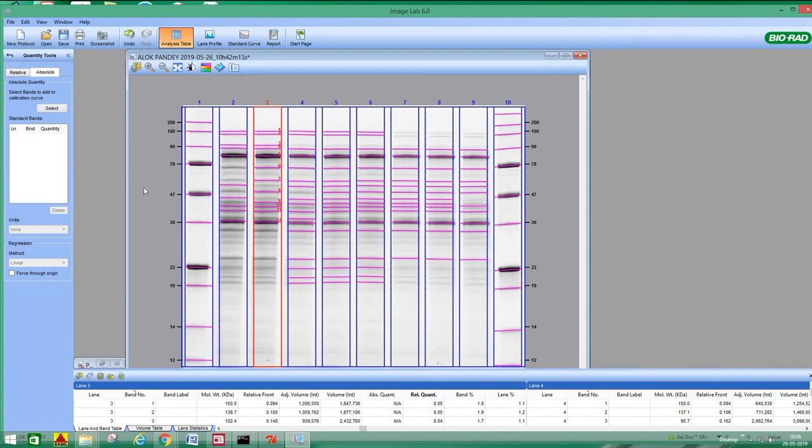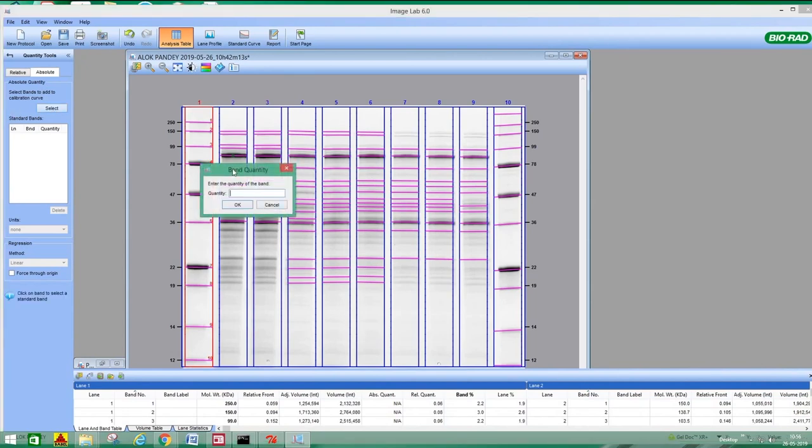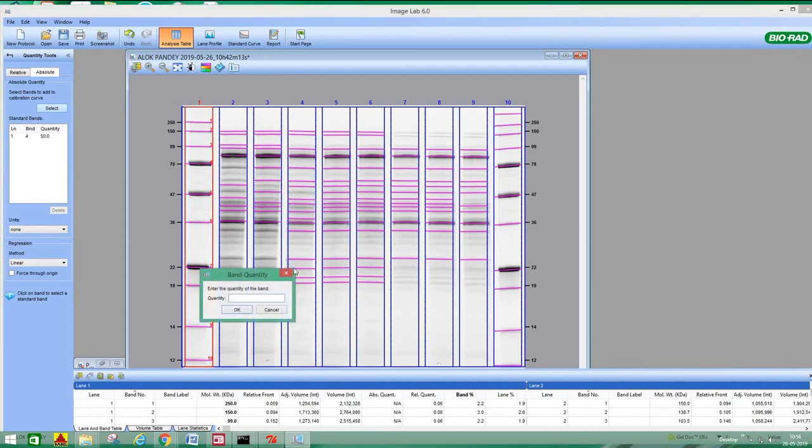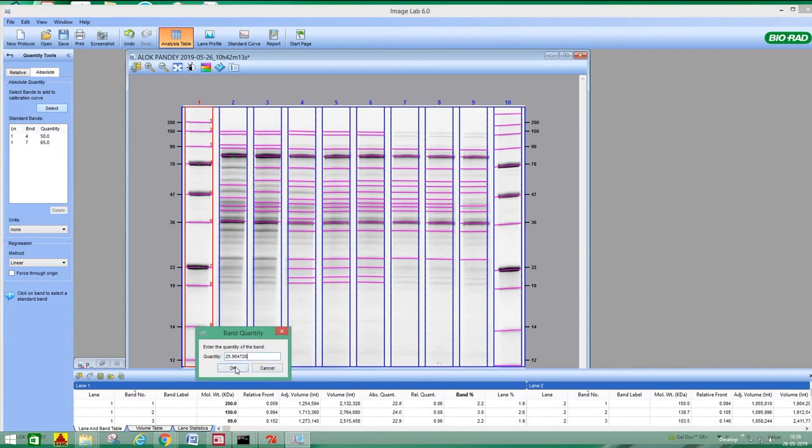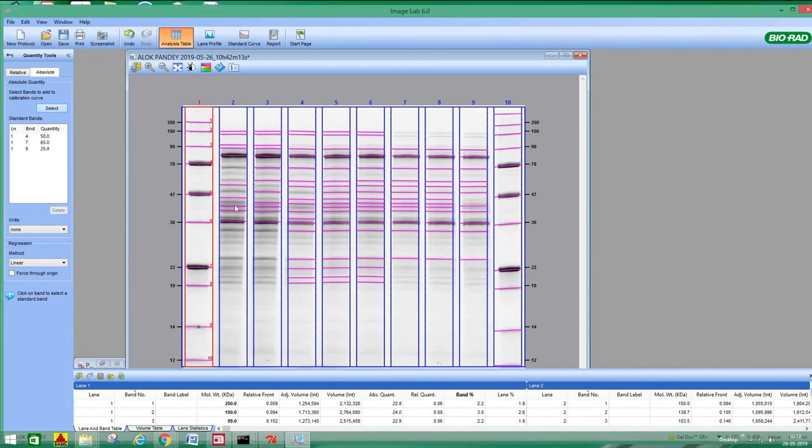At least you need 2 to 3 bands. So see, I am selecting this one, and I am saying this is the quantity of 50 nanogram, and I am selecting this quantity of 65 nanogram, and I am selecting another one, this is 25. I mean automatically it gives.